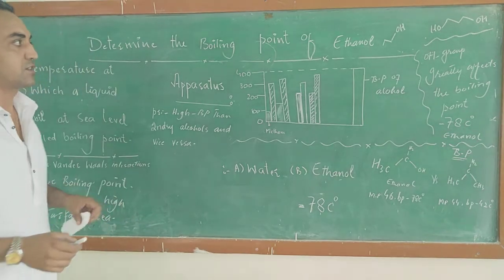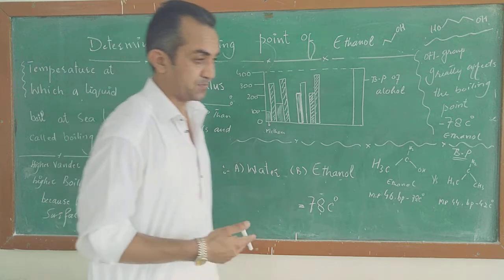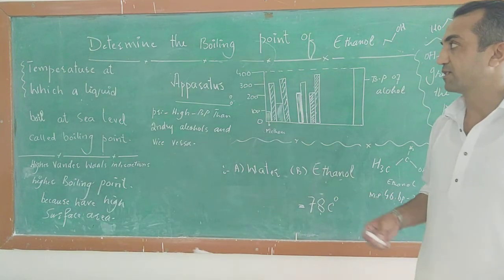In today's experiment, we will demonstrate how to determine the boiling point of ethanol. Ethanol, you know that these are alcohols, and we use alcohols for different purposes in our daily lives, like recreational purposes, medicinal purposes, and educational purposes.